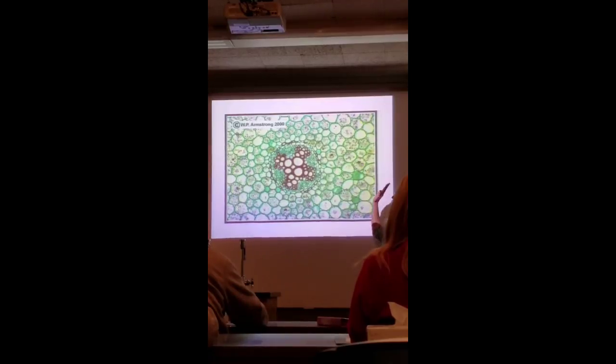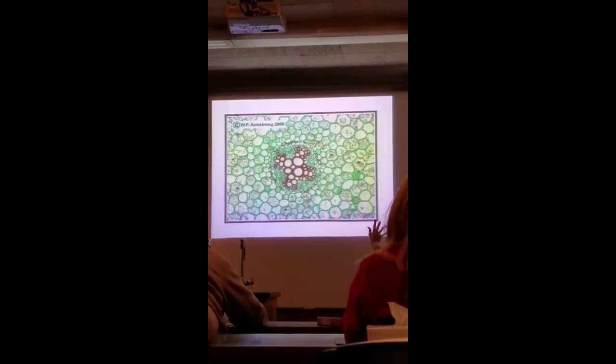Ground meristem gives rise to cortex and pith, which happen to be made up of parenchyma. So when I say simple cell type, you should think of all the -enchymas. Those are all simple cell types. Complex tissues could be epidermis, xylem, or phloem. Those are some complex tissues.